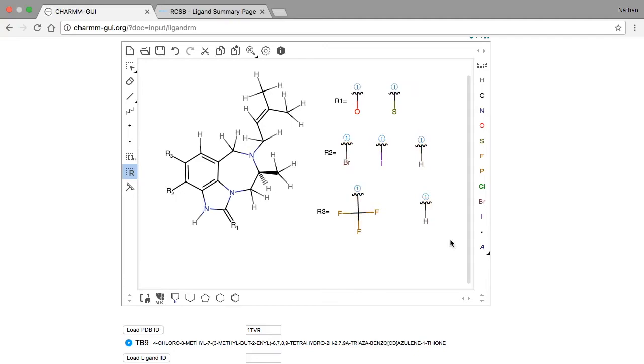Notice that each box we drew was automatically labeled R1, R2, and R3. Because of this, it's very important that you draw these boxes in exactly the same order.